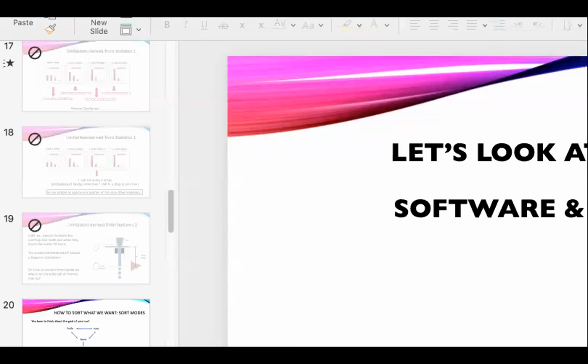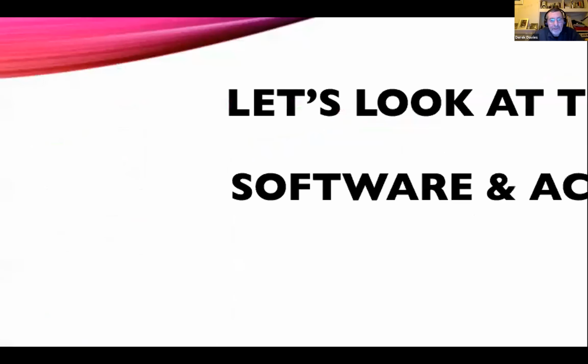So I'll be quite quick as well in this bit. Which obviously helps if you are ready. If I were ready with this, doesn't it? There we go. So that's what we did.